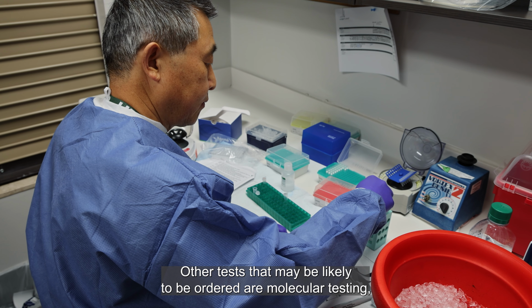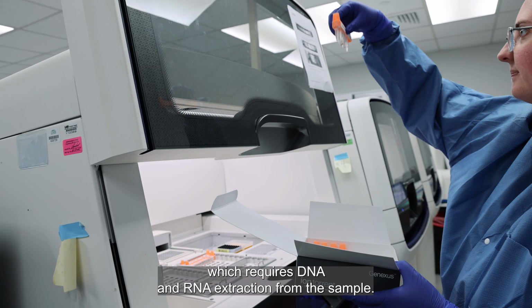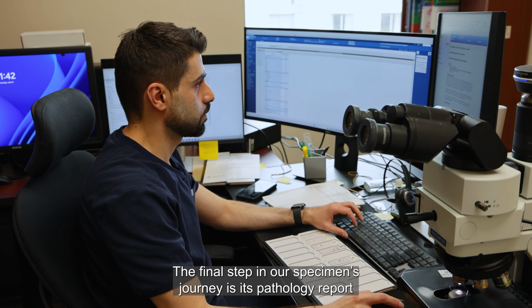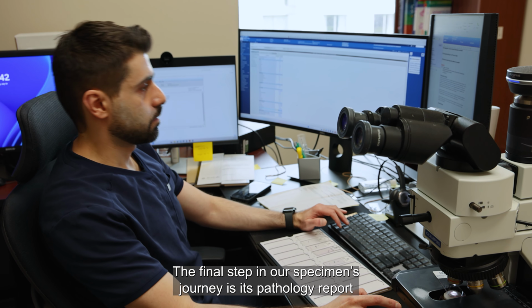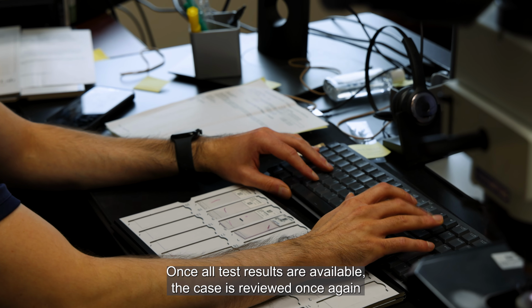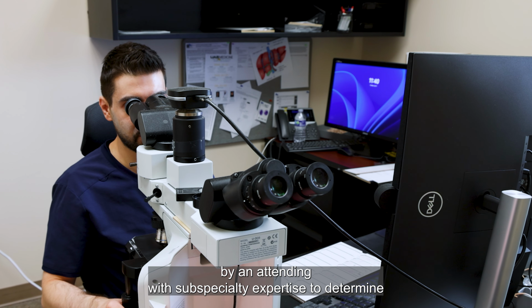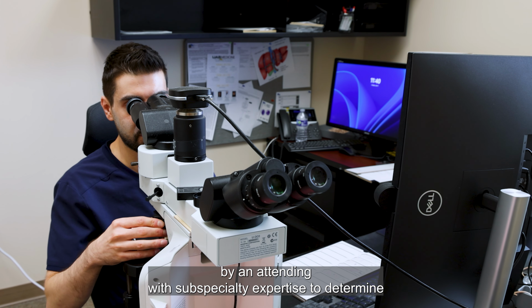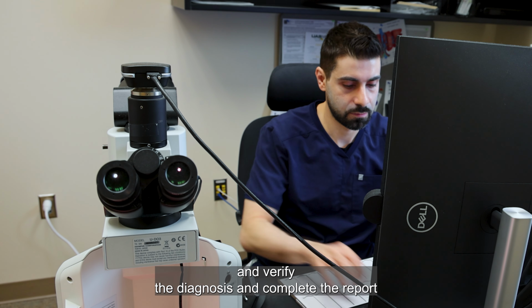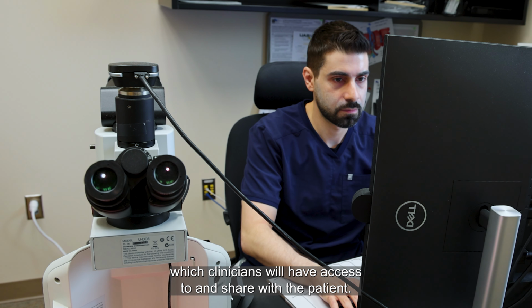Other tests that may be ordered are molecular testing, which requires DNA and RNA extraction from the sample. The final step in our specimen's journey is its pathology report construction and verification. Once all test results are available, the case is reviewed once again by an attending with subspecialty expertise to determine and verify the diagnosis and complete the report, which the clinician will have access to and share with the patient.